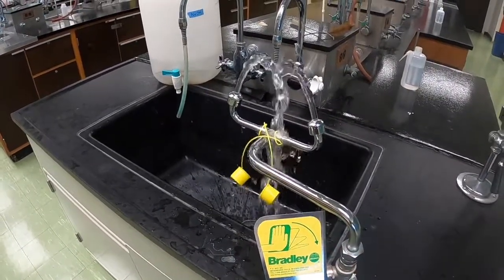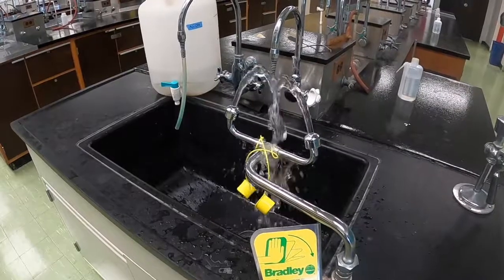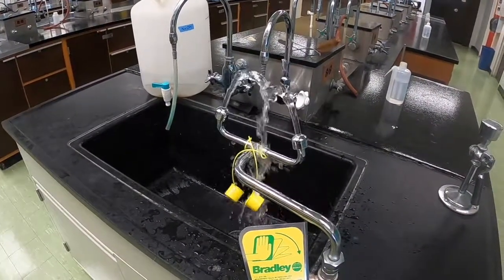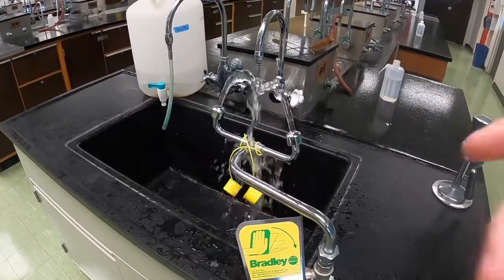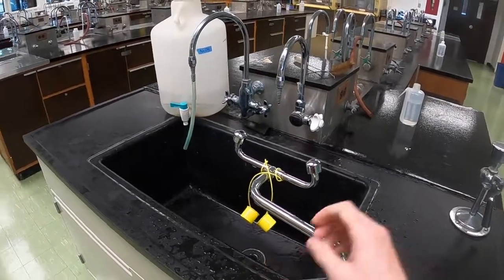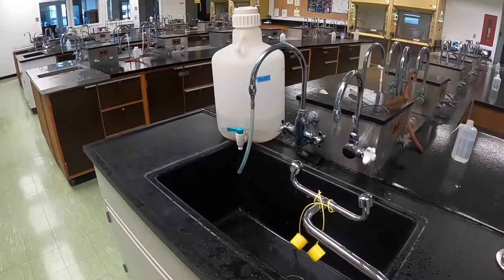You hold your eyes open with your fingers. You lower your head so that your eyes are immersed in the water, and you leave them there for about 10 to 15 minutes. Using an eyewash is very uncomfortable — your eyes go numb, it becomes hard to see, and I really recommend that you try to avoid needing one.